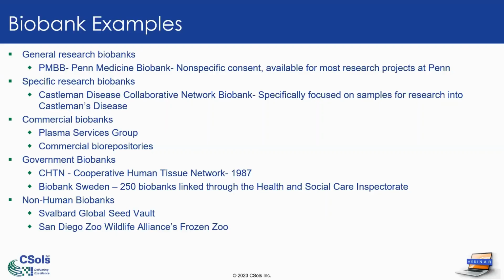biobanks. So CHTN is a cancer-focused biobank in the US that is run by the US government. It was founded in 1987, and I would love to know what they were using to track their data in 1987. Biobank Sweden is all of the Swedish healthcare system, major hospitals linked together for the terms of research through their Health and Social Care Inspectorate.